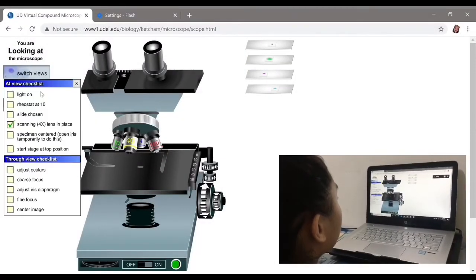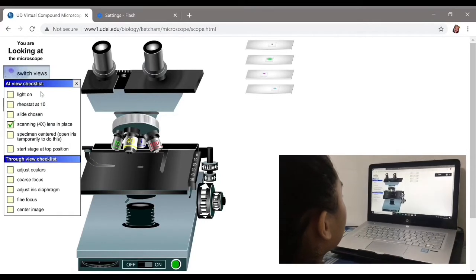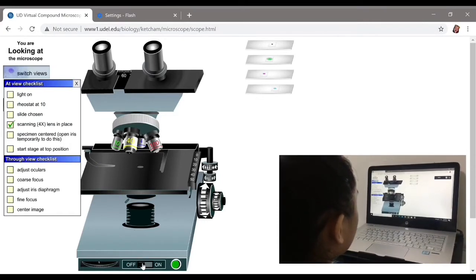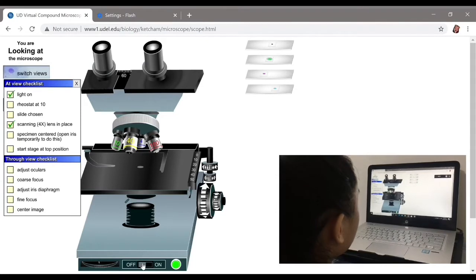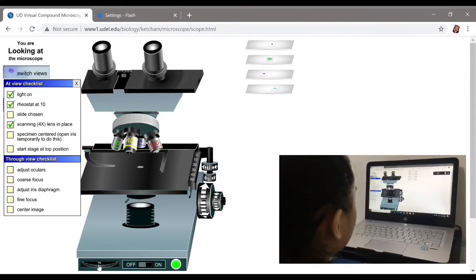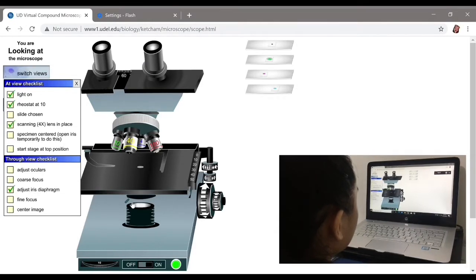First, I clicked on the checklist. And then, turned on the light and adjusted the rheostat to 10. For additional brightness, I also adjusted the iris diaphragm.